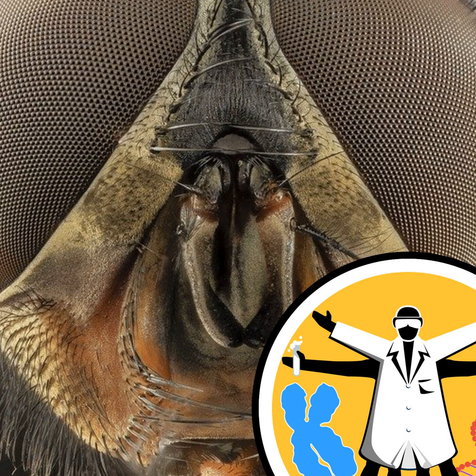How big was the trace of chicken and fish in there? It wasn't very high, and I think this comes around to some of the caveats of our experiment. We would have needed another fly taken from a completely different environment and extracted as well. That would have controlled for any DNA in our environment when we were doing the extraction in our labs, or given us a background of what's normal in a fly.